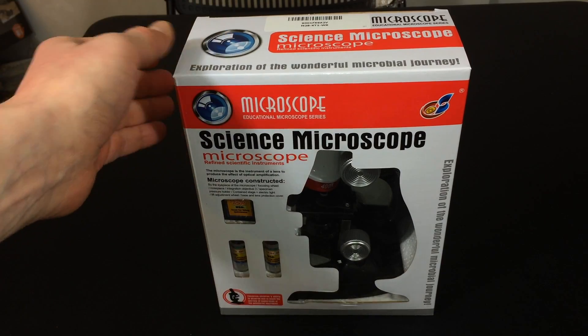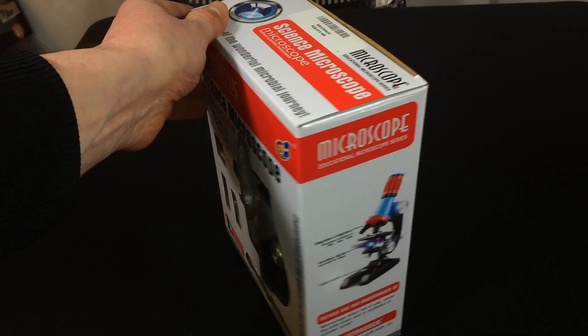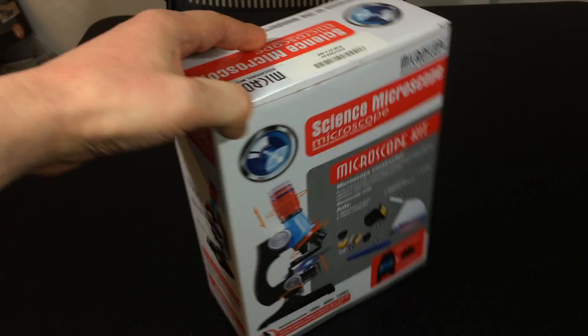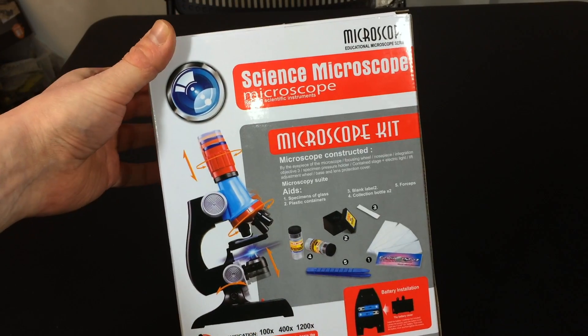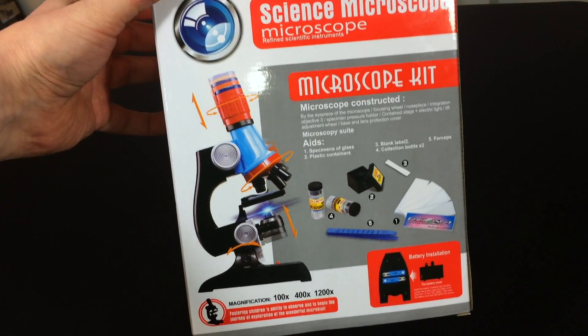So we're going to unbox it together and we're also going to look at what's included and we're going to try to see down the actual microscope lens to see if we could see anything. But this is the box. Let's just see what it comes with.